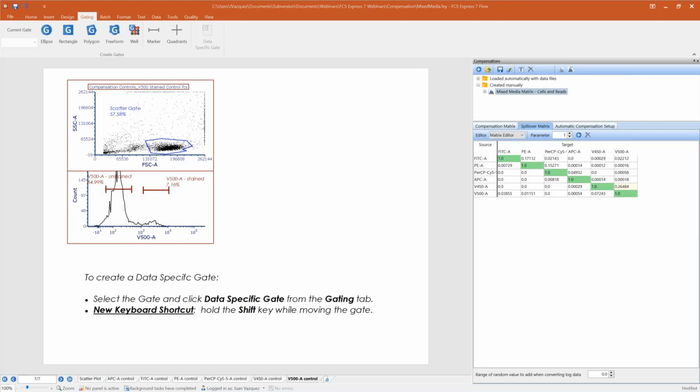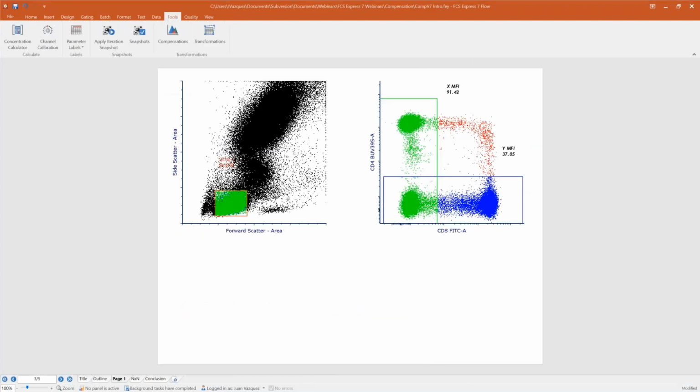All right. And finally, I want to talk about one of the new features that we've added for FCS Express 7. This was a feature that we've gotten a lot of requests for over the years, specifically the ability to add an n-by-n matrix of plots. Those of you that aren't familiar, n-by-n refers to the number of parameters within a data set, and you're creating a number of plots to accommodate viewing all those parameters in some permutation within each other.